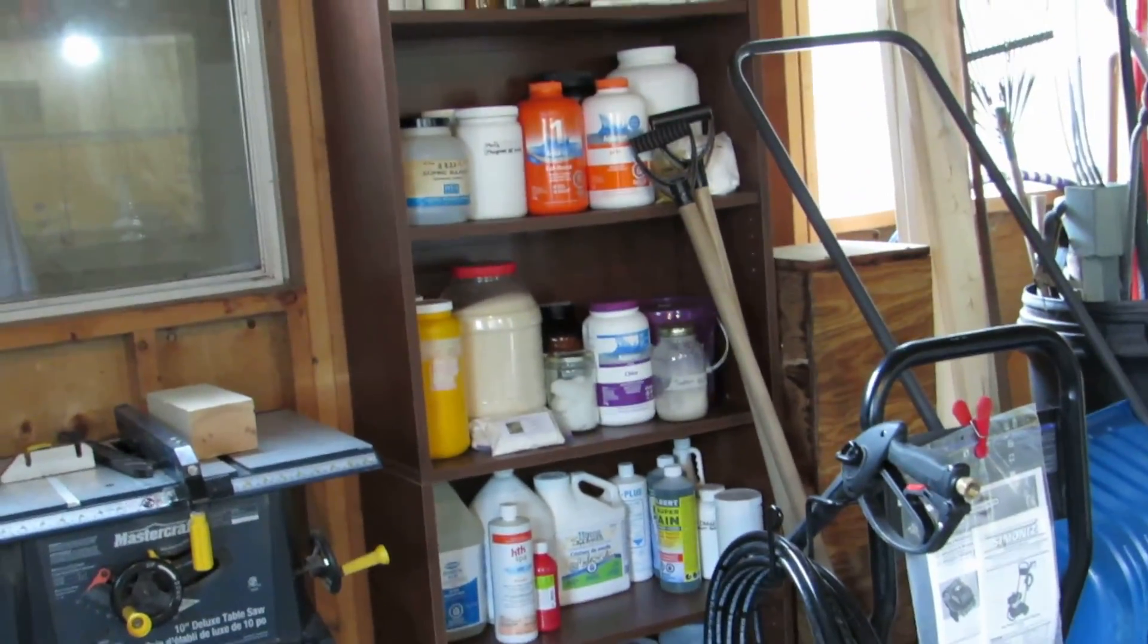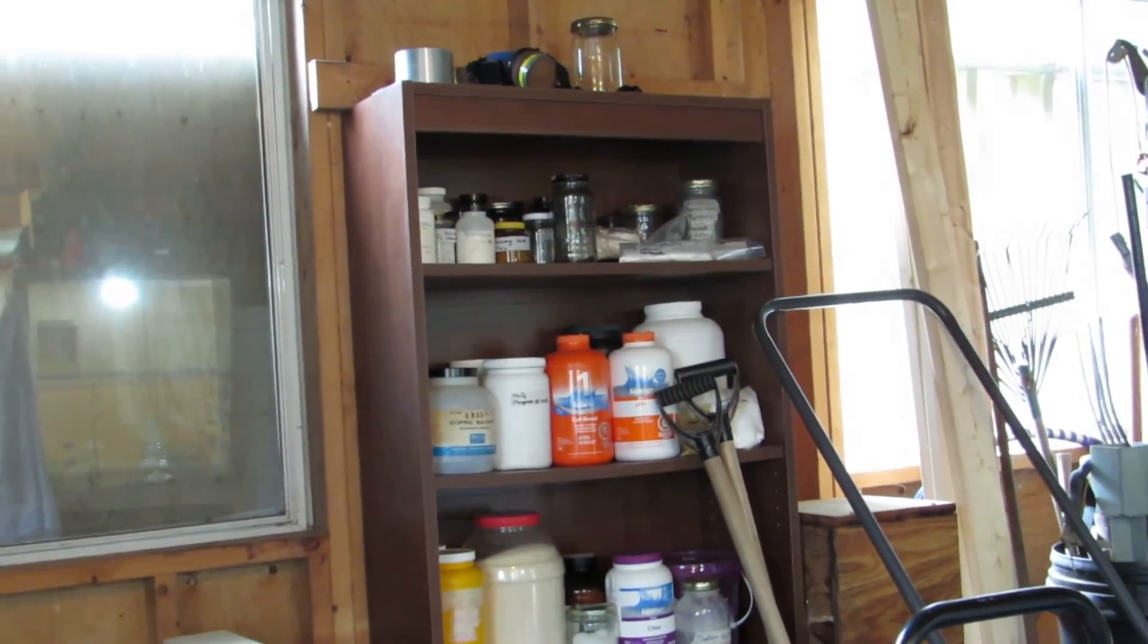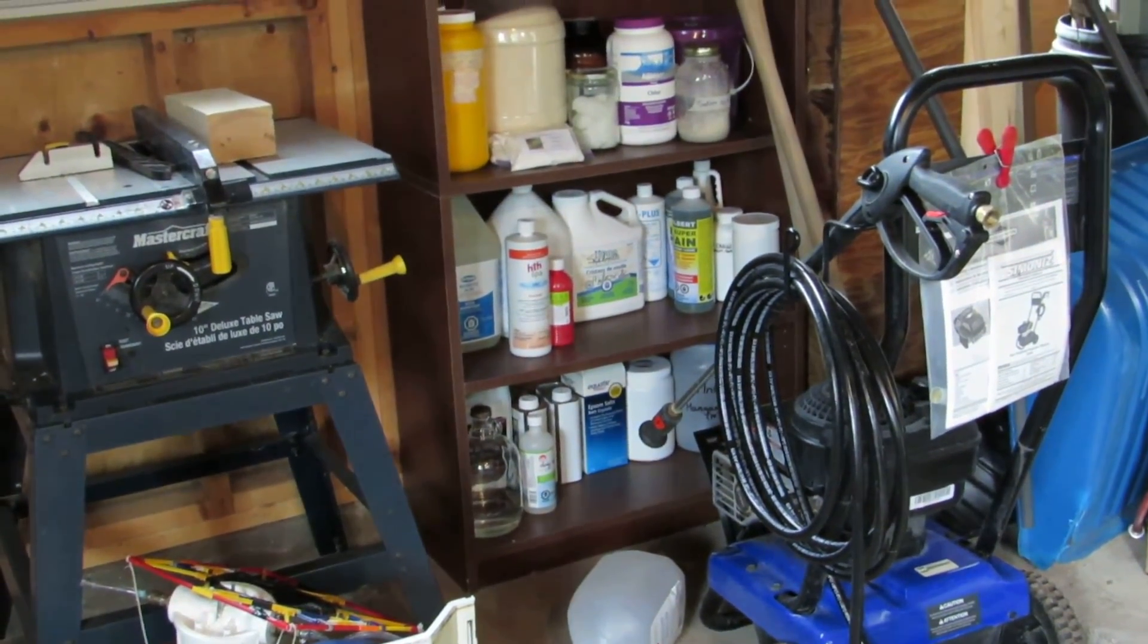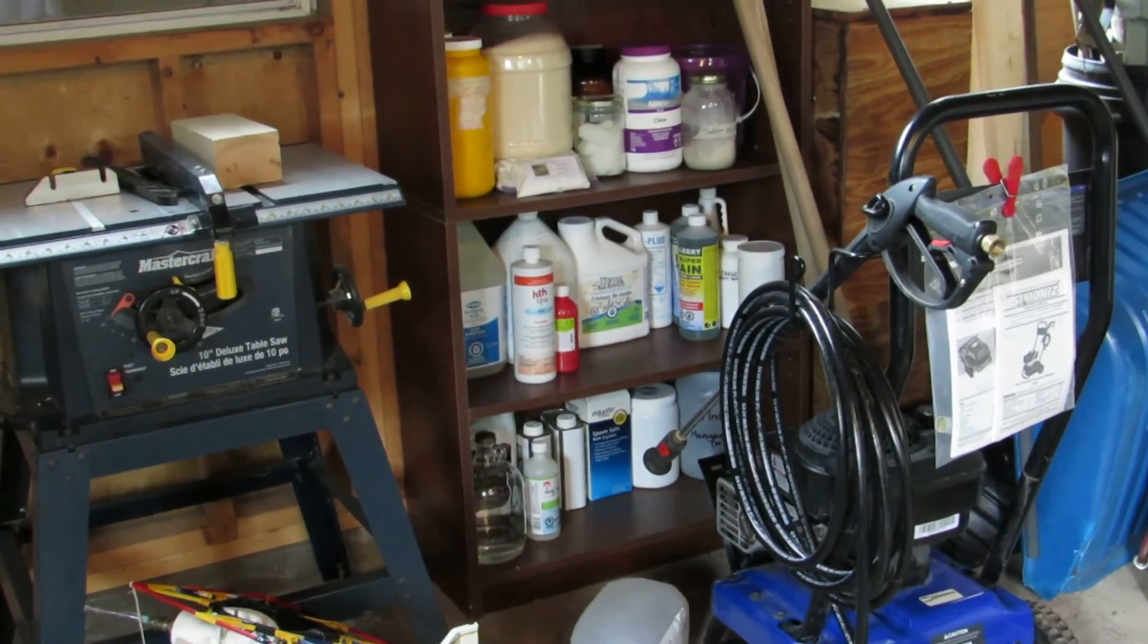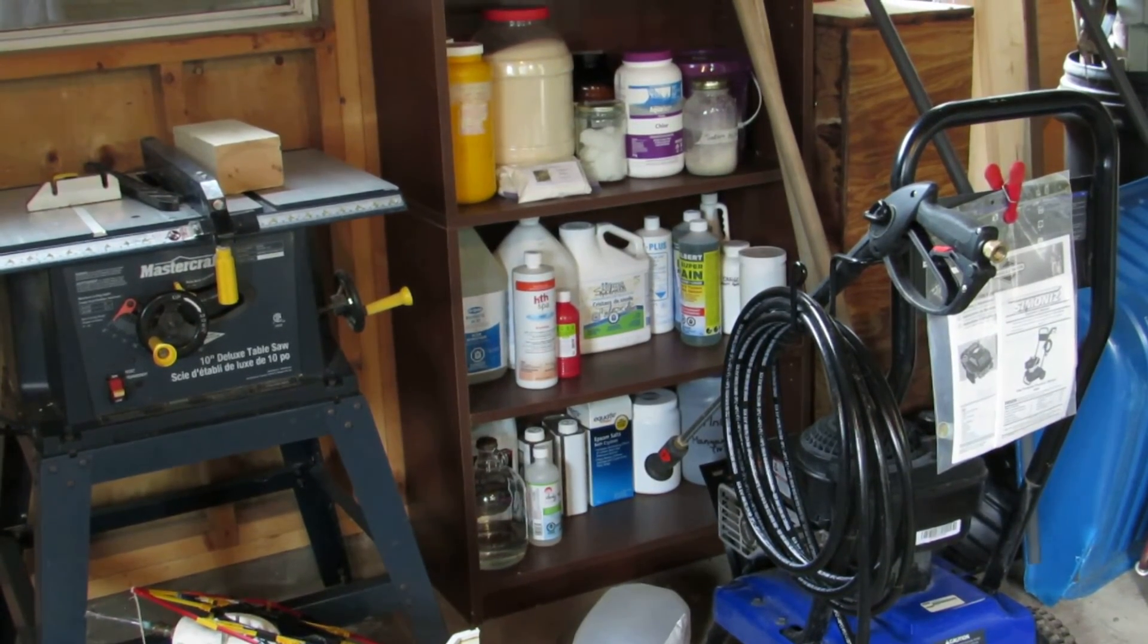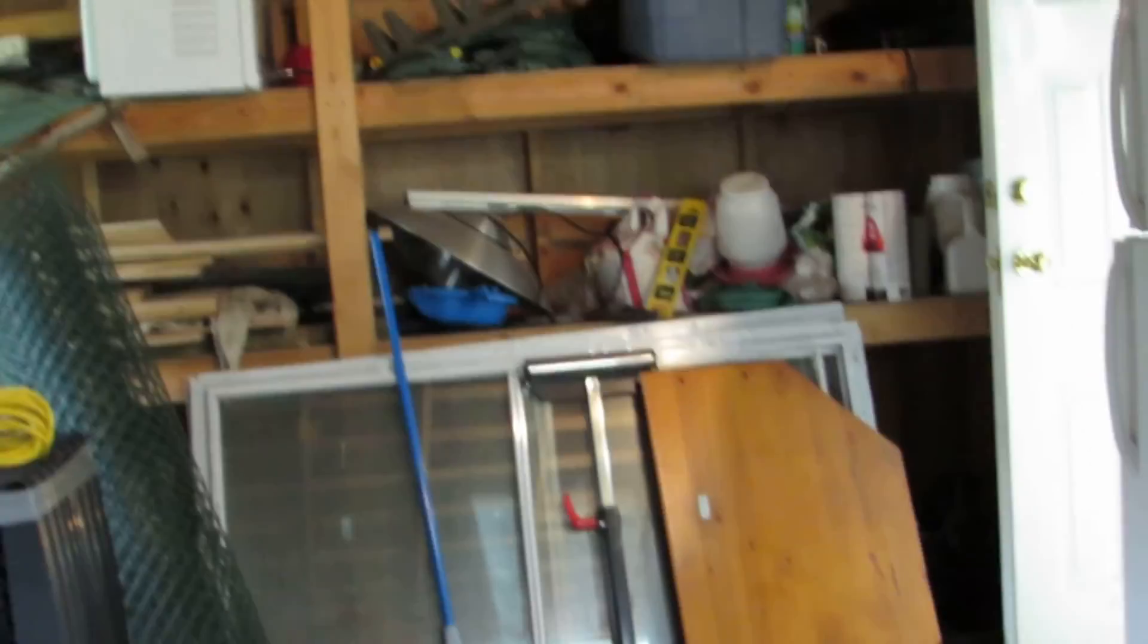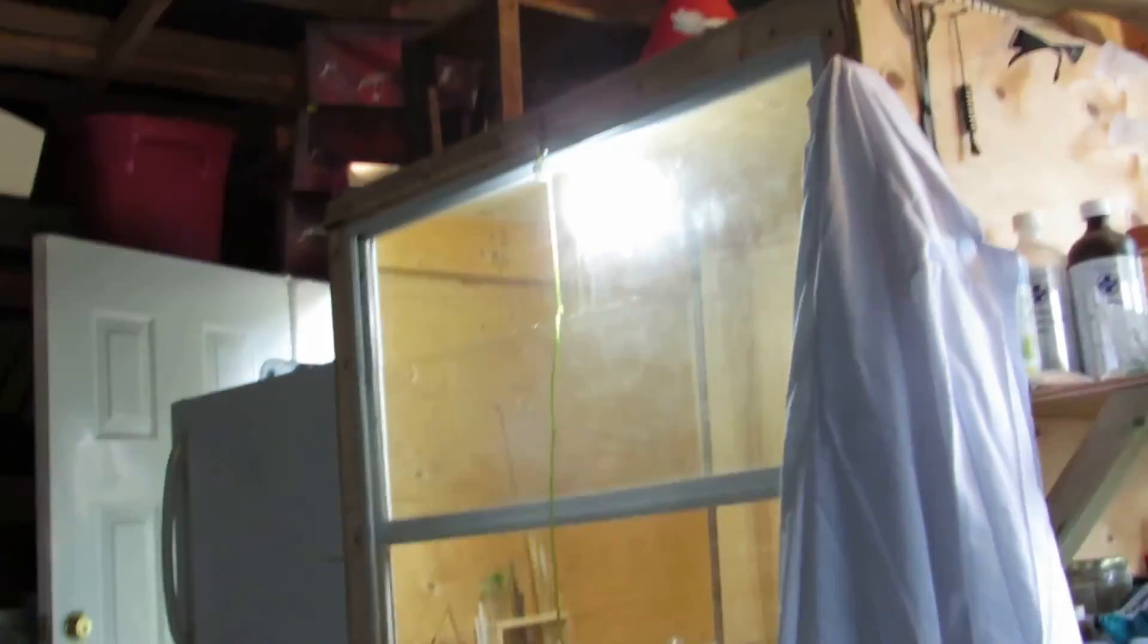And then I do have this other shelf over here and this is where I store a lot more of my bulk chemicals. So that's everything from sodium hydroxide to ammonium sulfate and calcium chloride. All sorts of stuff up there. And I do have to share this space with my dad who's got a whole bunch of other stuff over there. But for the most part a lot of this is mine and it all works out pretty well.